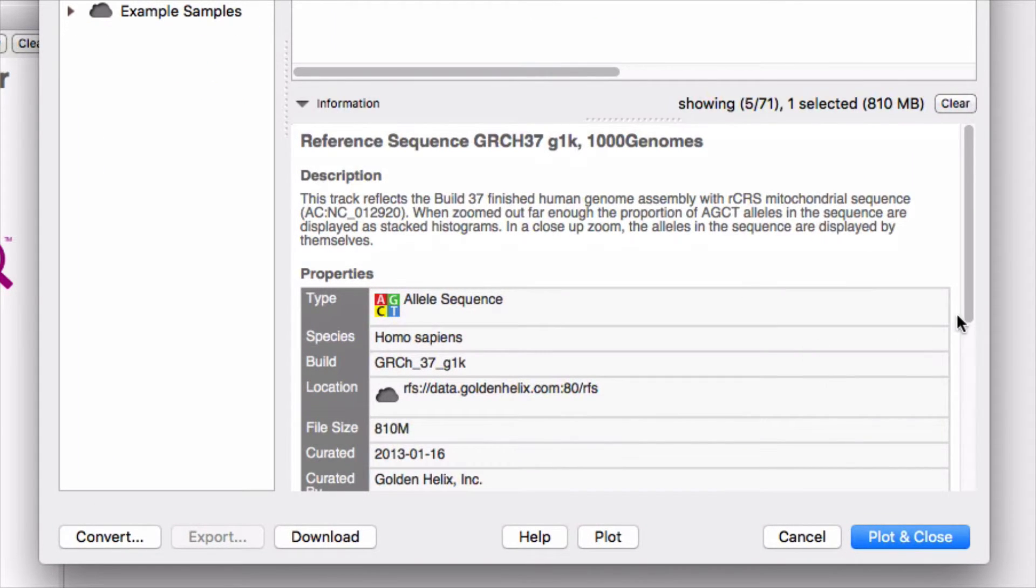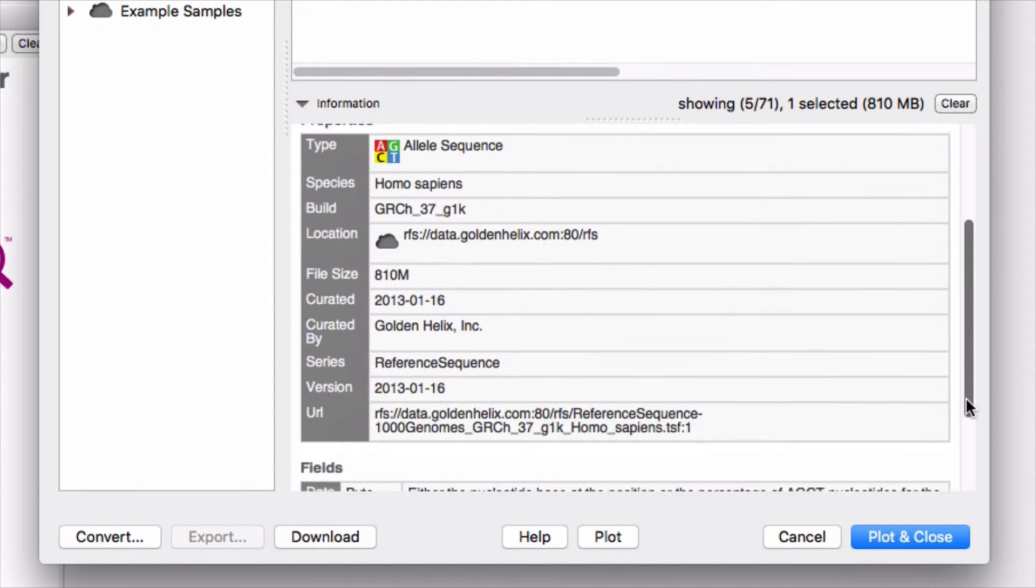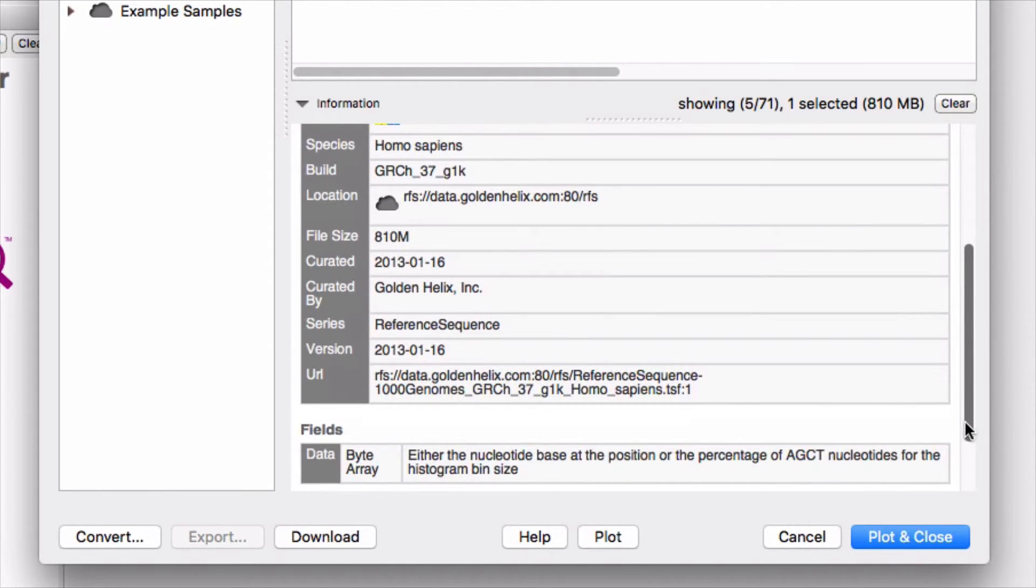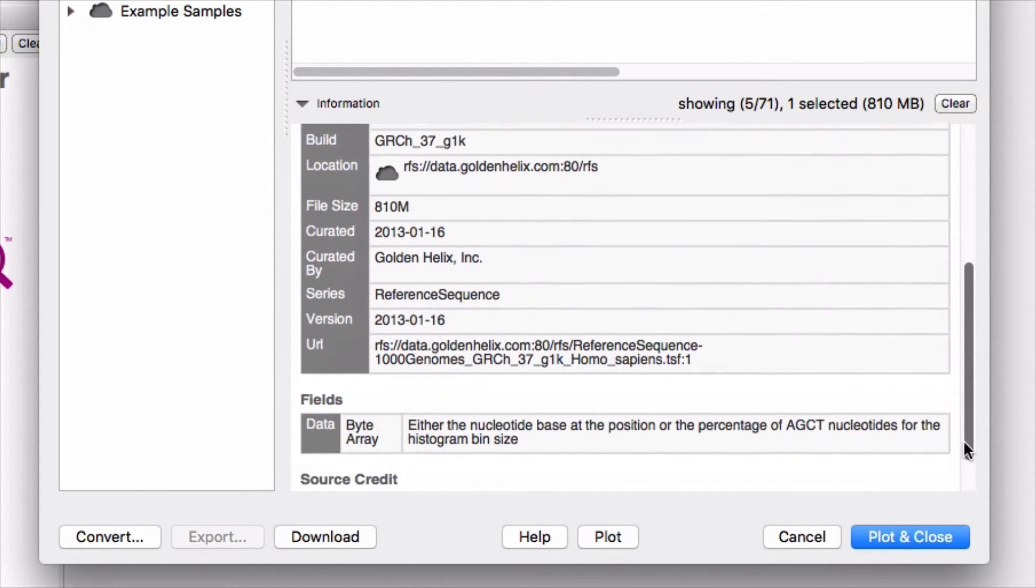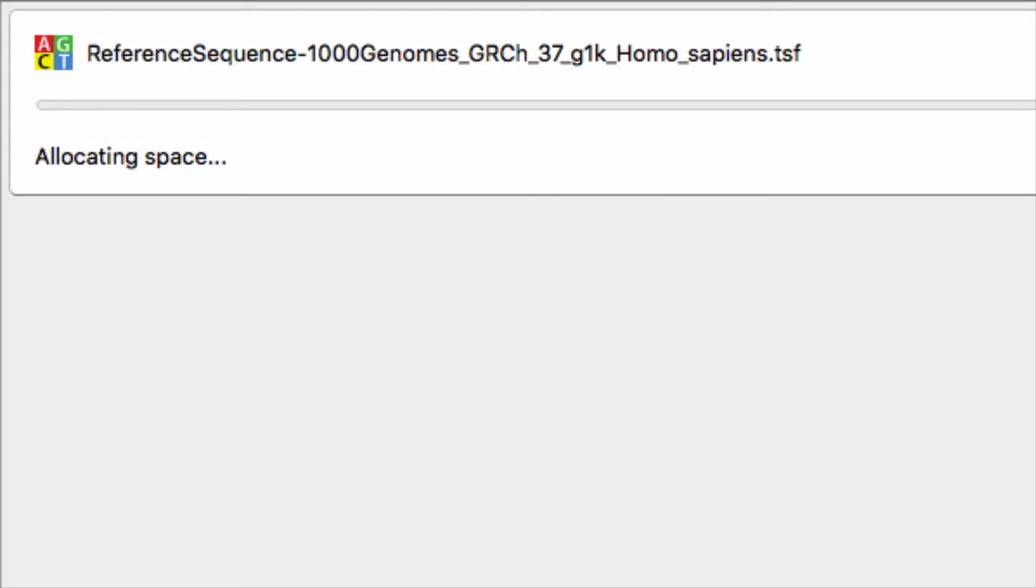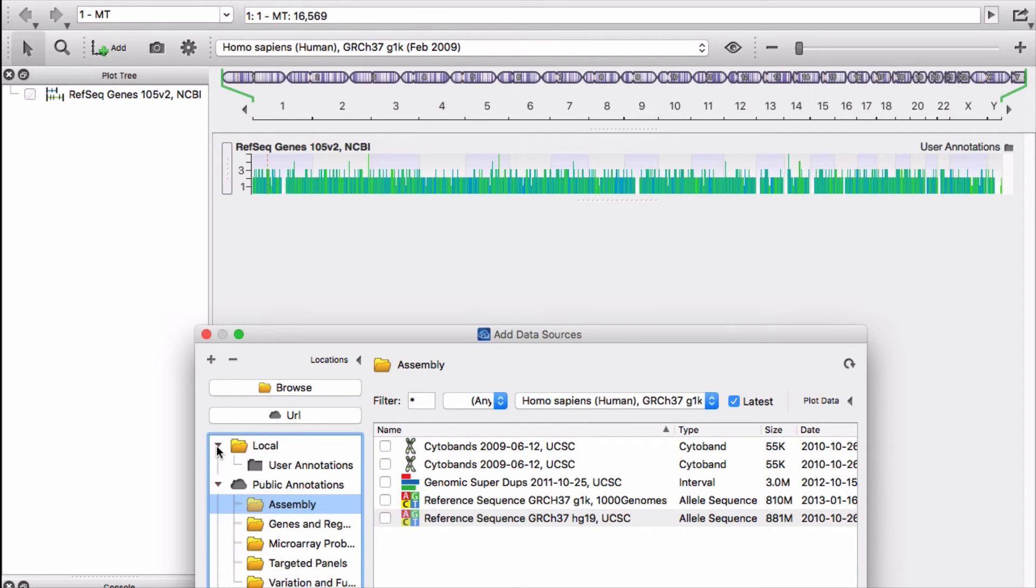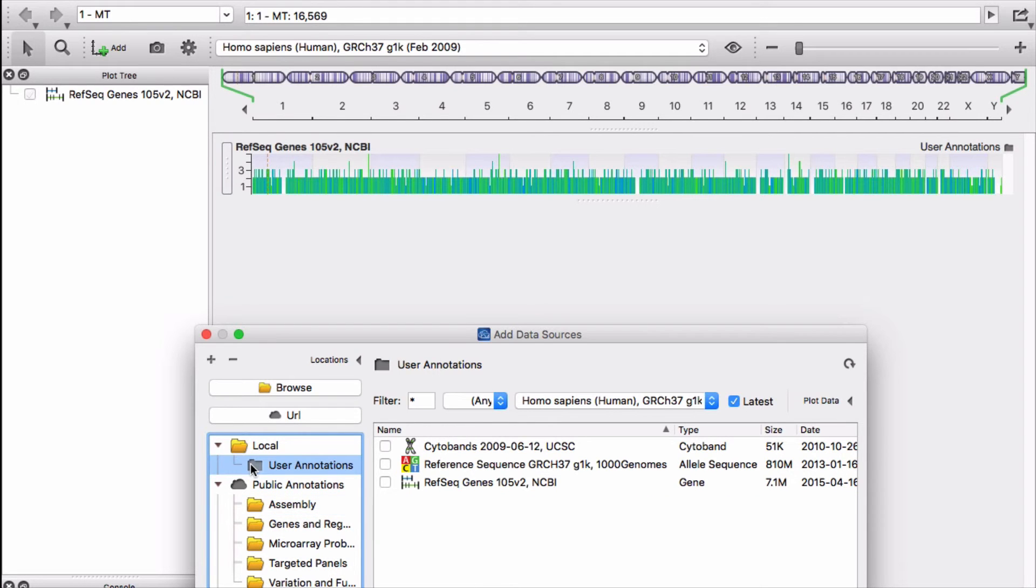You'll want to download this file to your computer. Otherwise, you will experience significant delays during operation. Click the download button. A window will appear that monitors the progress of the file download. When the download is finished, you'll find a copy of the file in the user annotations folder that's inside the local folder.